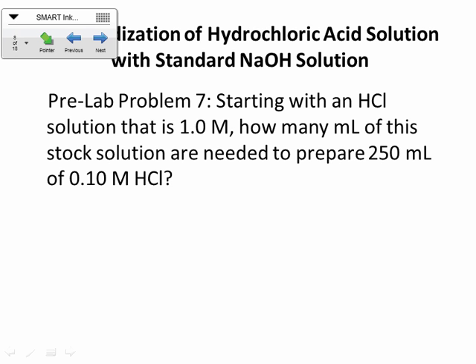So my question was going to be, what would be the best piece of lab equipment to use to prepare this solution? Just thinking about what we talked about with the AP chemistry new course description the other day, can you think of what that piece of equipment would be in order to make, not do the titration, right, but to actually make the solution, to dilute it down so that you're adding it up to a 250 milliliter mark, perhaps? Remember what those are called? Close. It's not an Erlenmeyer flask.